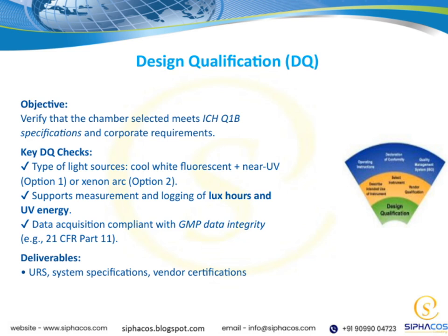Another important aspect is whether the chamber supports measurement and logging of lux hours and UV energy. This capability is vital for tracking exposure over time, ensuring consistent quality and compliance with testing protocols. We also need to ensure that the data acquisition system complies with GMP data integrity standards, such as 21 CFR Part 11.